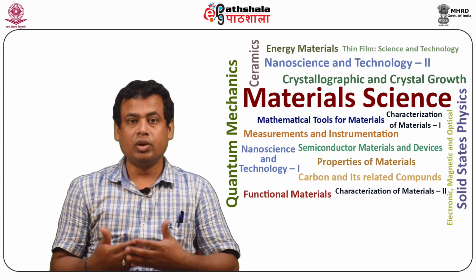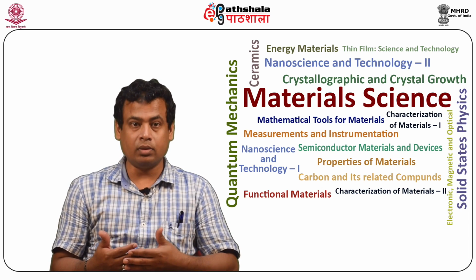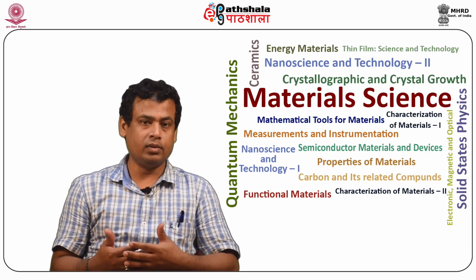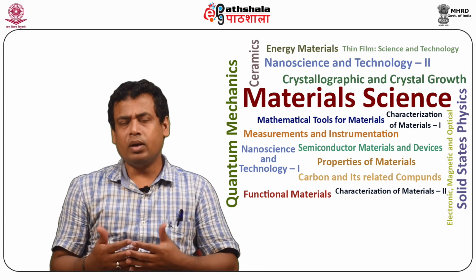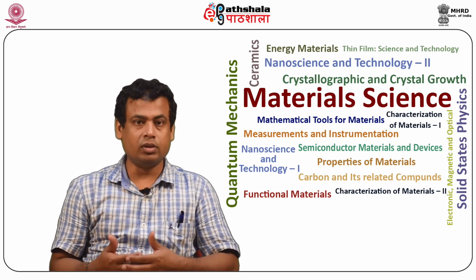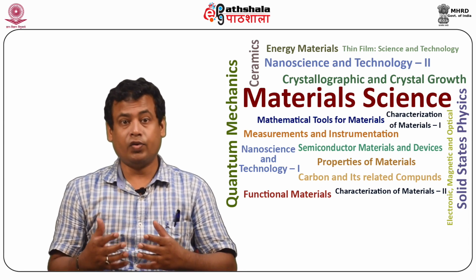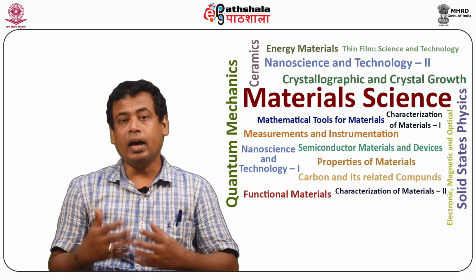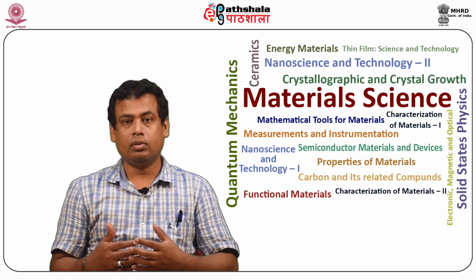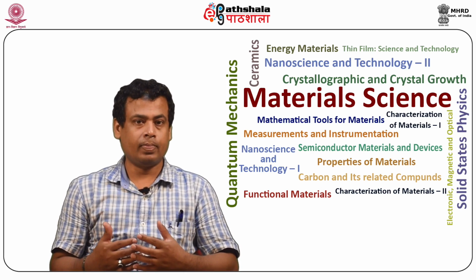Electron beam lithography is developed using a scanning electron microscope, to which a pattern generator and a beam blanker are added to control areas of the viewing field to be exposed. Modern electron beam lithography tools are fully dedicated patterning systems that employ high brightness electron sources for faster throughput and high resolution mechanical stages to be able to expose step by step large substrates under the relatively narrow field of focus of the electron beam.